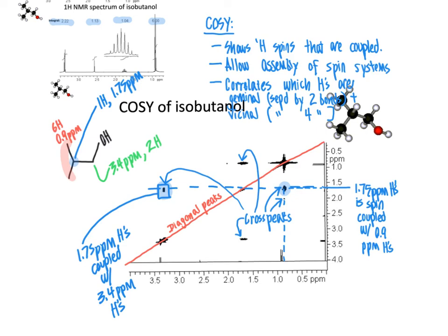There is one signal in the proton NMR spectrum at about 2.6 ppm integrating to one proton that we haven't mentioned within our COSY spectrum — that signal corresponds to the hydroxy proton. Generally, protons that are directly bonded to nitrogens or oxygens appear in proton spectra as singlets, and if they show up in a COSY spectrum, their correlation signals are very weak. When we look at the signal at 2.6 ppm and look for cross peaks, we see there are none, which is typical for such protons.